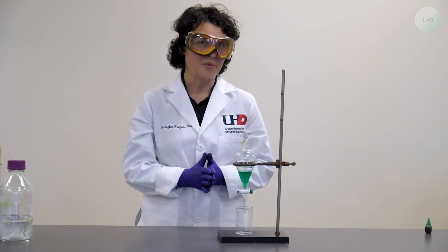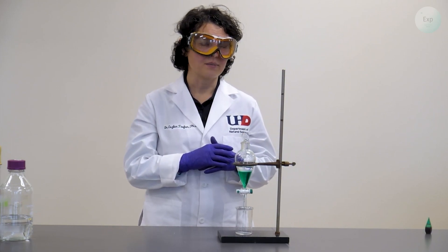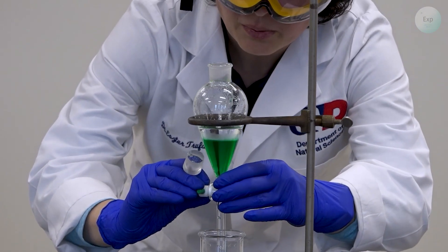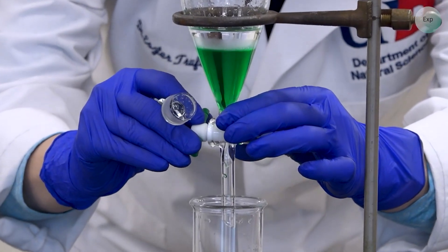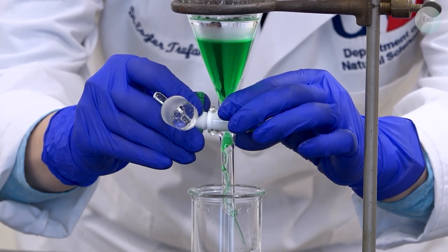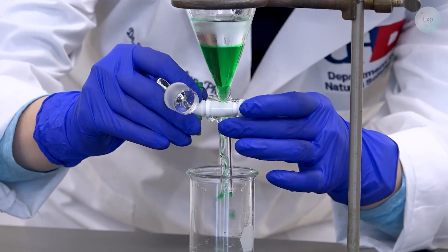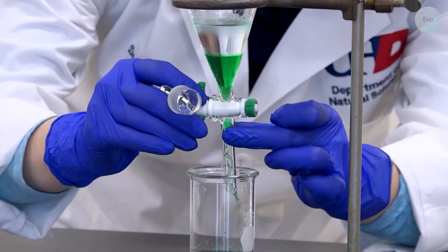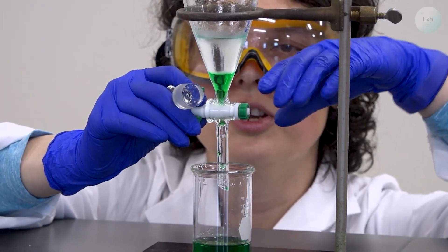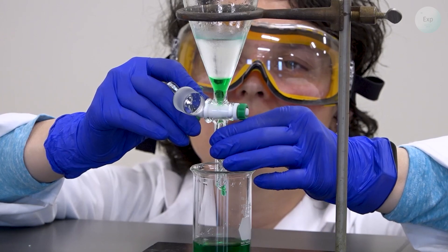When the layers are sufficiently separated, you may proceed with the separation. You can do it quite slowly — that will help the separation further. First step: remove the cap from the separatory funnel and hold it away from you. Next, very gently open up the valve and slowly, in a controlled fashion, release the lower layer. You can see how the green layer and the clear layer are quite separated. When the interface of the layer is very close to the valve, that is where we need to slow down and make sure we can control when to stop the water.